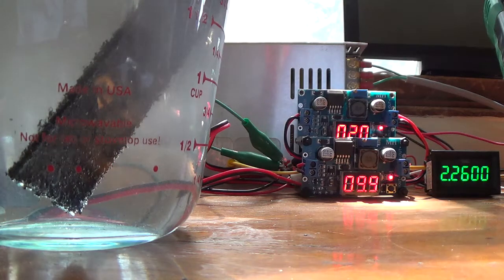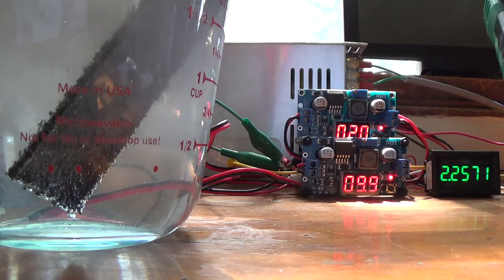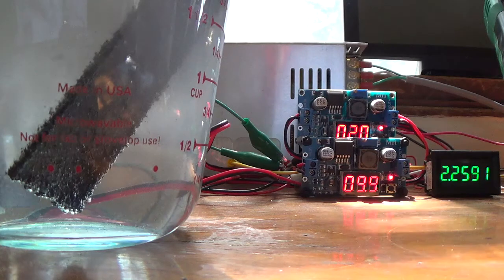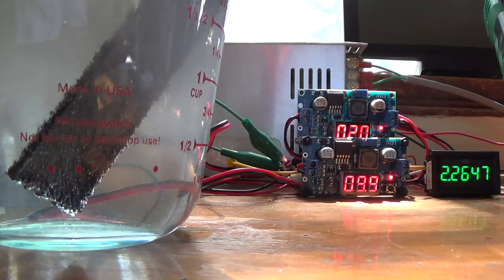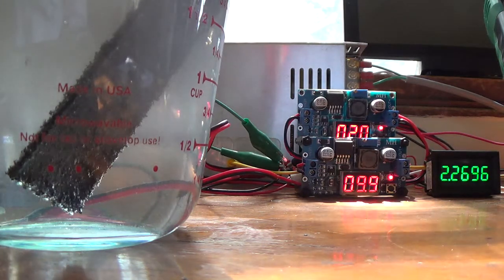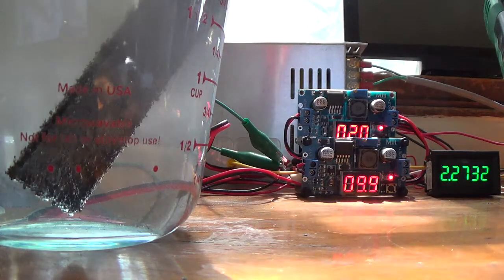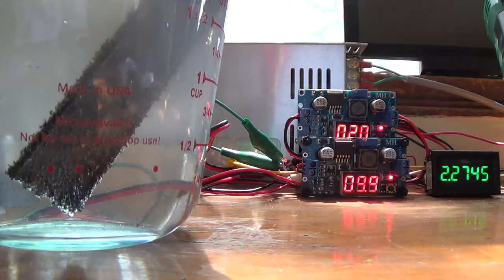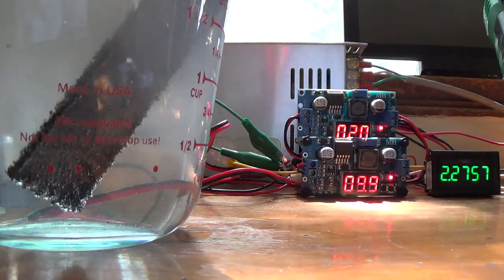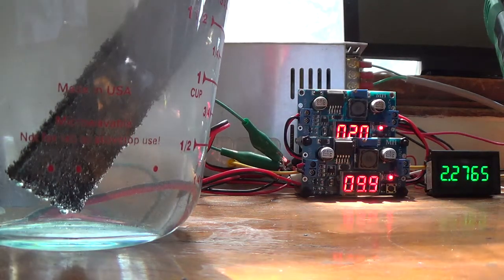No gasification or other effects were seen during the 2 volt process, which is what we expected, and during the 10 volt cycle we're seeing the exfoliation happen as we expect. The solution even looks more like what Robert Murray Smith was using in his, being that it is a clear liquid as opposed to the cloudy murky bit. But it seems to be progressing much better.